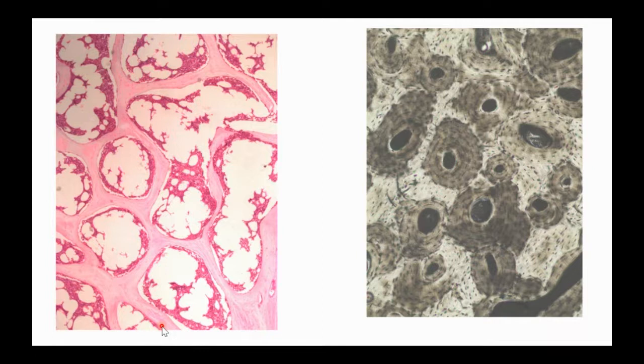And we'll talk more about this in a couple of weeks, but when we're looking at spongy bone tissue, these little fingers that we see here are something called trabeculae. I'm going to type that in the chat. Trabeculae. That's a word that we'll come back to when we're doing lesson number 6 in lab. You probably can't see them super well because I know it's hard for me to see on my screen, but there are some little dark spots inside these trabeculae, and those dark spots are still the osteocytes. They're still the bone cells.